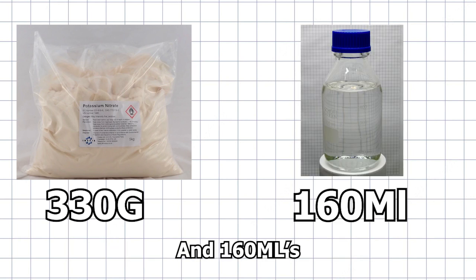For this experiment, you will need 340 grams of potassium nitrate and 160 milliliters of 96% sulfuric acid.